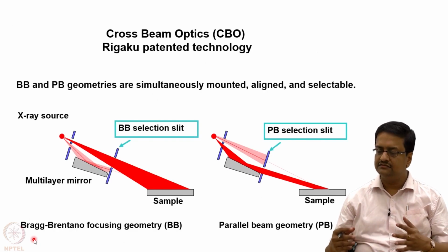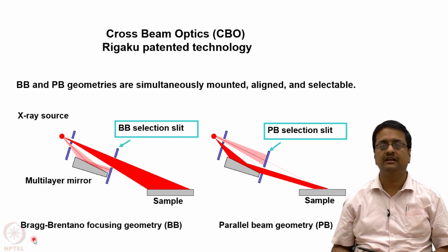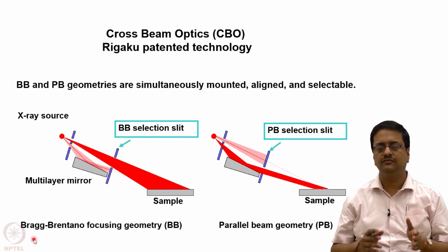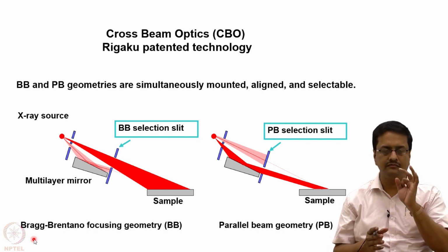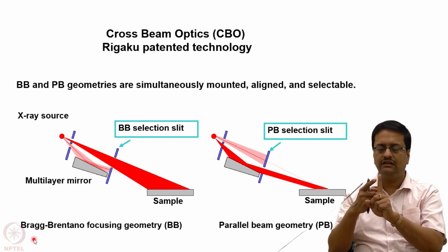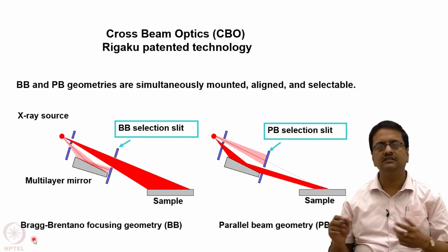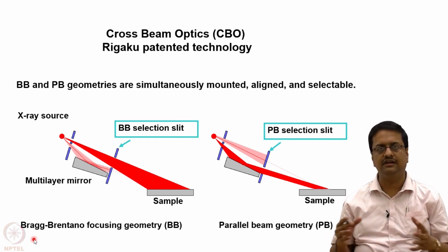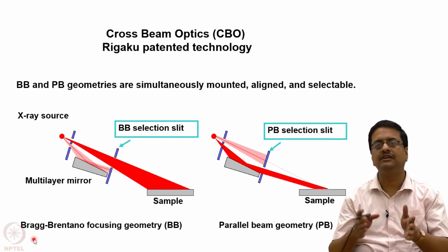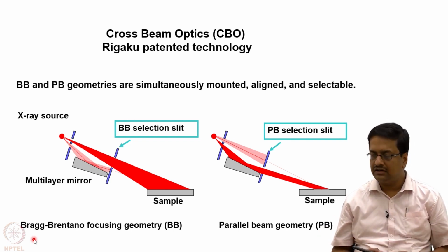This slide is going to describe the optical alignment of this powder X-ray diffractometer X-ray beam. See, for a powder diffraction, we do not use a circular focused beam, we use a line focused beam where the line is falling on the sample. So now this line can be a divergent beam or can be a parallel beam. So there are two different ways one can use that beam for the experiment.